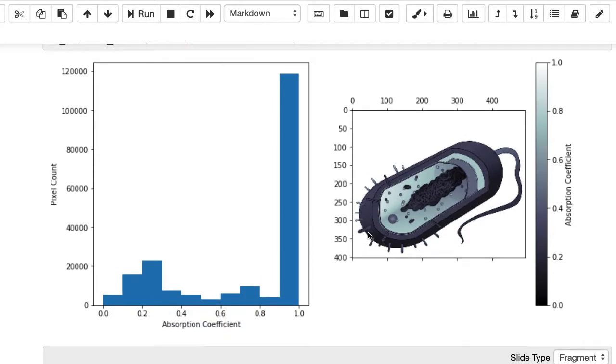And what we see is that we have the ability to quantify or qualitatively describe a lot of different things in the image that we're able to see. This is a flagellum, these are cilia. This is the same color as the nuclei, but it's not connected to it, and so we count it as a separate object. This shouldn't be undervalued, because what's quite important is that you're able to bring some common sense and judgment to your analysis.